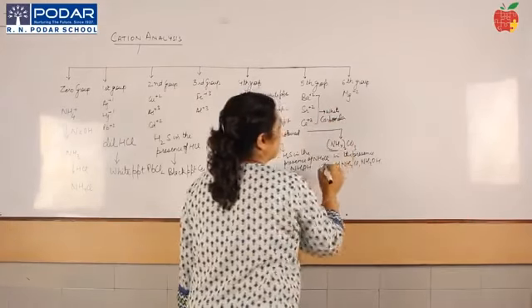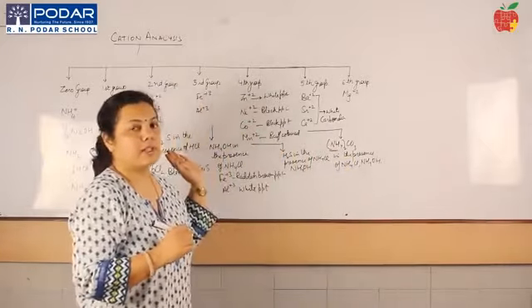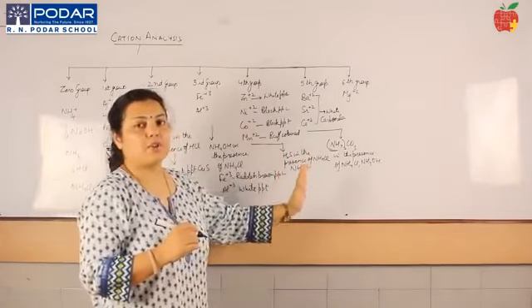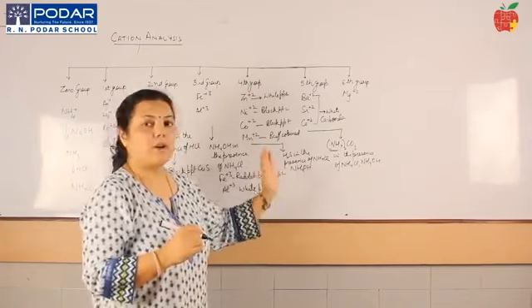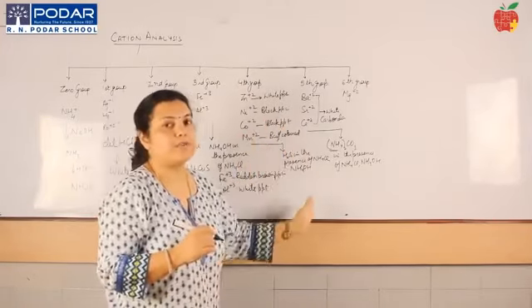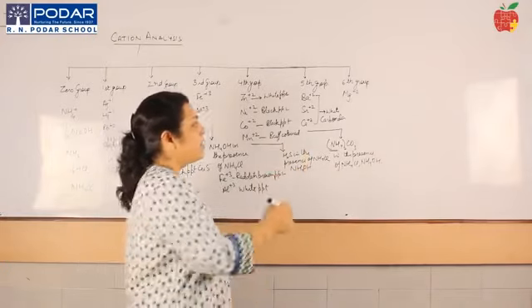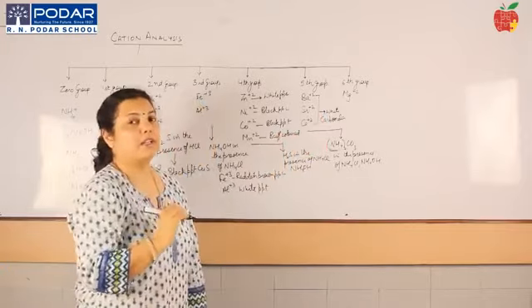So the reagent which is written over here in the presence, now you know that this scheme is based on your solubility product and common ion effect. So you need to understand the common ion effect and Le Chatelier's principle and the kind of precipitates which are being formed. Okay, so over here carbonates are there, now you get a white precipitate, carry out the confirmatory.